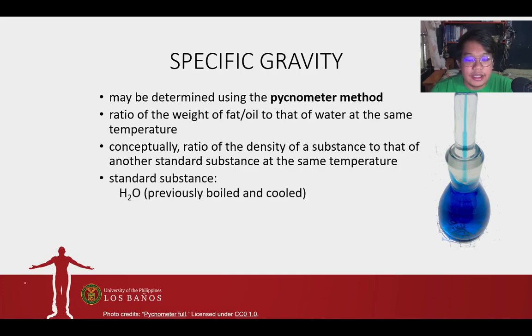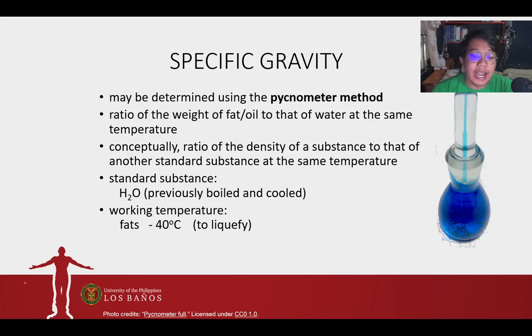Okay? So water, dapat siya ay previously boiled and cooled as to remove the dissolved gases present in your water. Yung mga dissolved gases kasi may contribute to the weight of your water as you do the specific gravity, no? So, yung mga nakapag-Chem 111.1 na dito, they know that they have to boil the water to remove the dissolved gases. Okay? And the working temperature for fats should be 40 degrees as to liquefy it. And for oils naman ay 25 degrees Celsius. Okay?